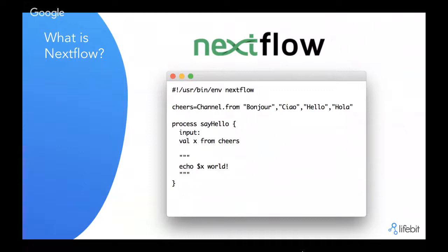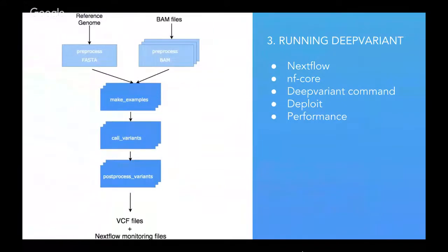Thank you very much, Pablo. Hello, everyone. As Pablo was saying, this is essentially what you need to run DeepVariant. In dark blue here, you have all of the main steps of DeepVariant, and these are all binaries that need to be executed. When we were trying to run this pipeline, it really wasn't scalable, because there are all of these different steps, and you need to get the outputs from one into the inputs for the next. This is where Nextflow really came in.